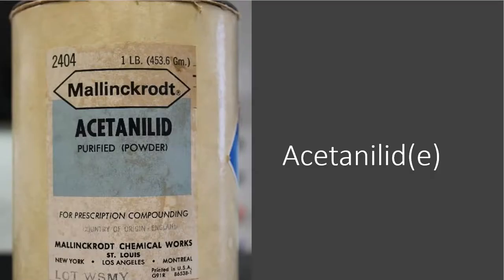The next component, I'm going to be using acetanilide. Now, this is a very, very old bottle. It's older than me. It was probably ordered back in the 60s or the 70s, and most of the time this comes with an E at the end of the name. So acetanilide, that probably doesn't give you an insight of what's on this structure as far as the benzene ring is concerned. So this one you probably do have to Google at a certain point in time, or Wikipedia.